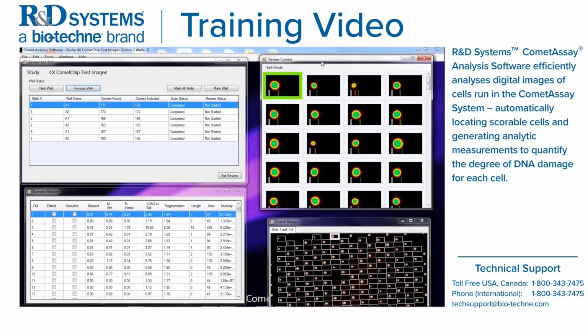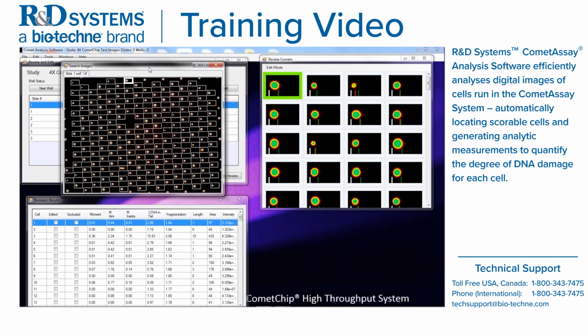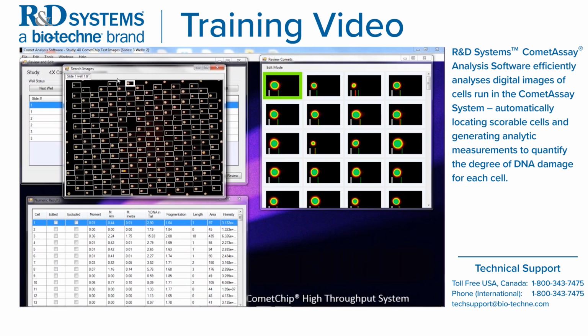And this Review Comet window is actually showing these individual comets. So in the Review and Edit, this is highlighted green. It's showing up in this, the first cell that's shown here. And it shows your tail moment, moment arm, percent DNA, the normal damage parameters. This window gives you a broad overview of each of these comets. So this is where this comet is positioned in the search image window.